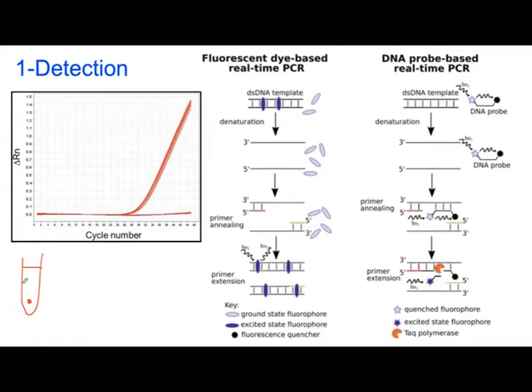So you design a primer that only binds to the bacteria, and you run SYBR Green. If you see a signal here, then you say, yes, this sample is contaminated with that bacteria. Okay, I got another person, he wants to know, okay, the bacteria is present, but I want to know if this bacteria has a specific mutation?